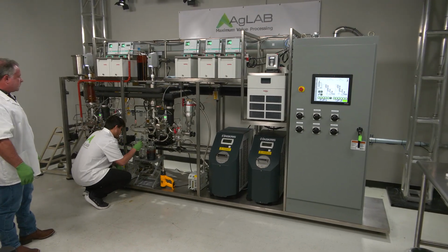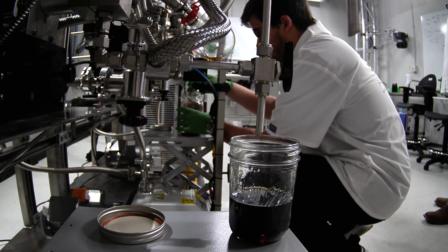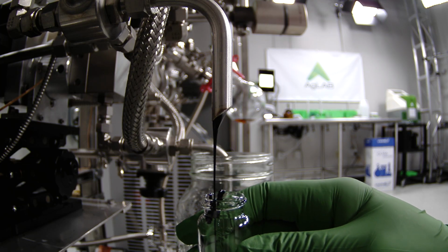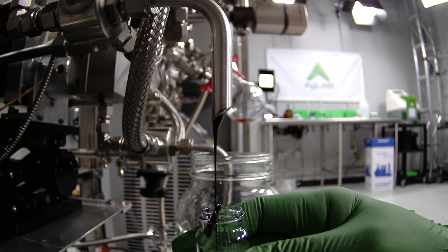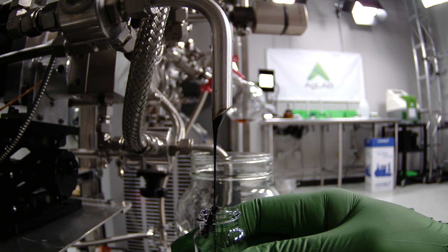All right. Now, tail samples, you have to be a bit careful. This can get very messy. It's very, as you see there, stringy. Very heavy as well, so don't need to collect too much. About a quarter of a way, just like with the heads.